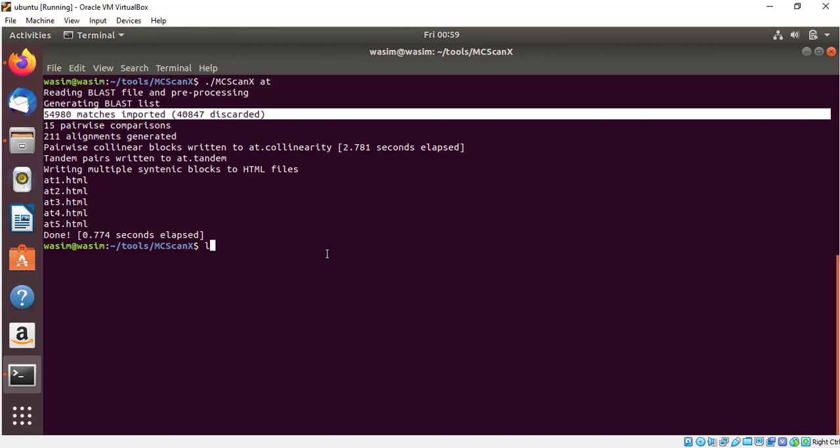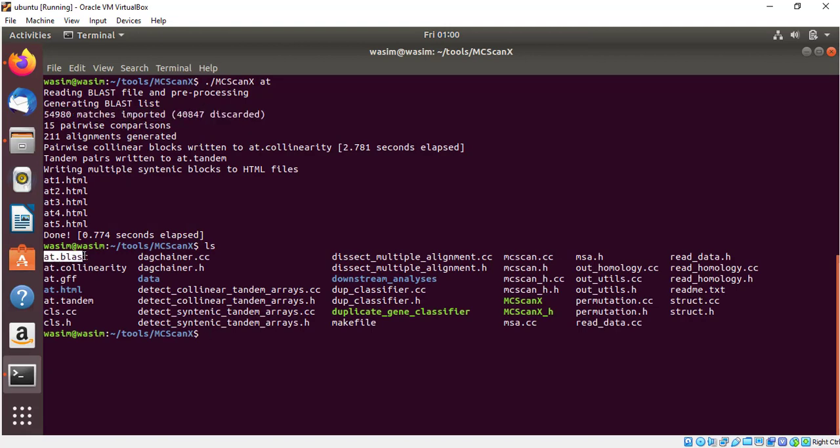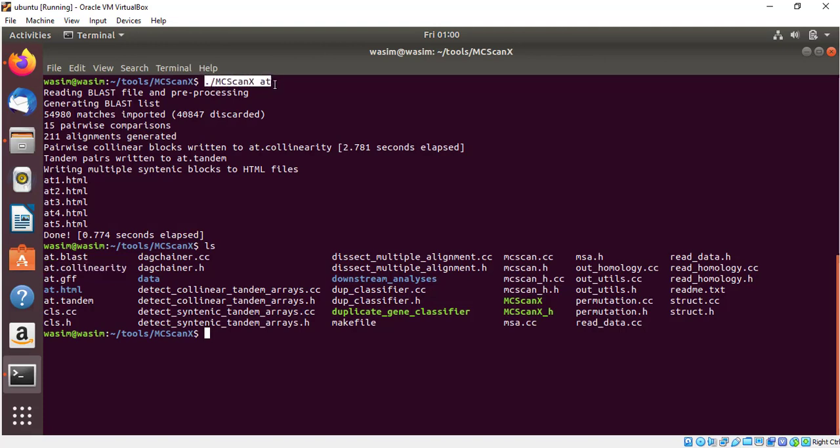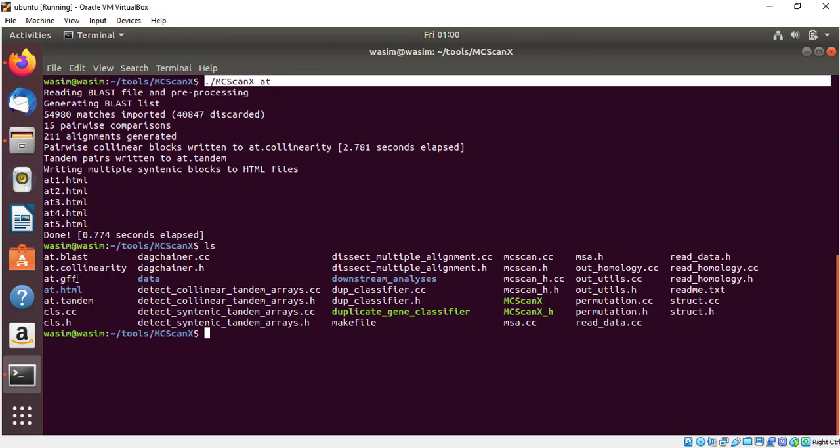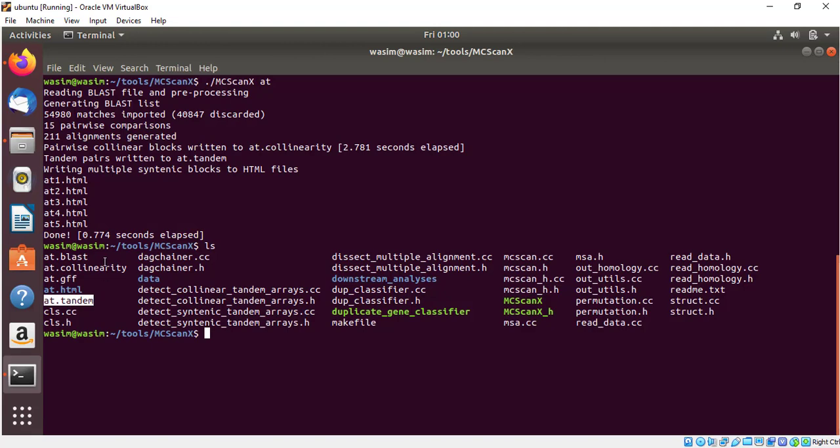To see this, simply type ls. You can see files which contain the name. This is my original file, and this is the collinearity file which is generated after inputting this code. These are the tandem duplication files. The dot collinearity file is for segmental duplications and dot tandem is for tandem duplication. Further you can use these two files for analysis as you want.